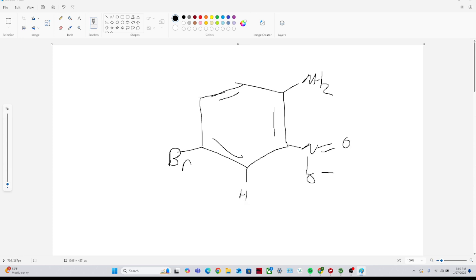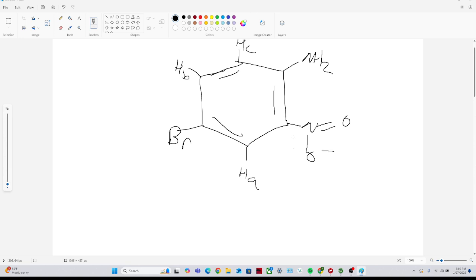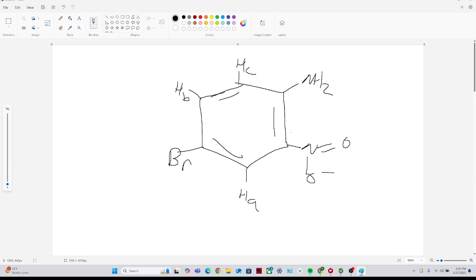First, when I do NMR, I like to label all of my hydrogens to identify whether or not they're chemically equivalent. In this case, that's completely dependent on symmetry. In this molecule, there is no symmetry. If I break it apart in any way, there's going to be nothing. So I'm just going to call these HA, HB, and HC. Once I've done this, the first thing I think about is, where are these going to be on the actual NMR chart?